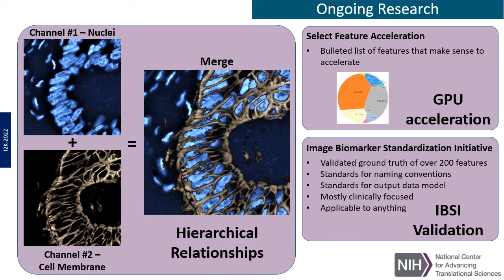Some components of feature extraction timing make a significant contribution: filters, image moments, and Haralick-like texture features. Apart from running other less demanding features in parallel with any of these 3, the timing can be improved by using a GPU resource if it's available on the user's platform.